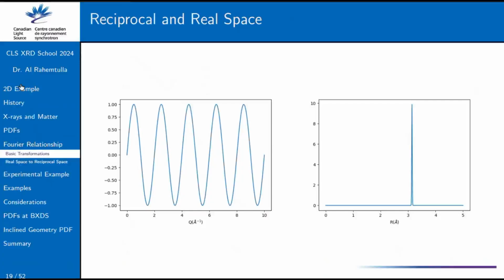So basically the thing I glossed over is that little integral that really does all the magic for us. I never became a big expert on really grasping that Fourier relationship, and I'm not sure how well versed everyone else is. But I figured we can go over some of the basics and build up a little toolbox to visually get a semi-intuitive understanding of what we're seeing when we look at some of our 1D scattering data and how that can contribute to our PDF.